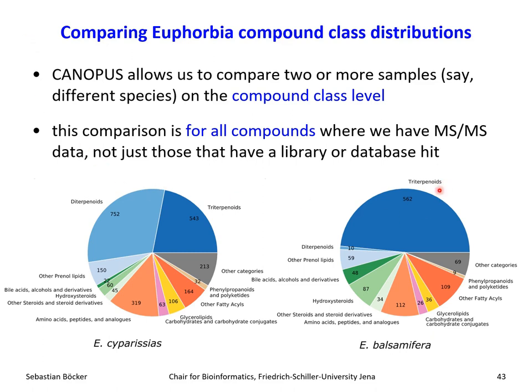And you might notice that triterpenoids looks bigger here than here, but that's not true. Like, it's almost exactly the same number of compounds that are annotated as triterpenoids. The big difference is the diterpenoids here. And you can see there are other differences on the compound class level. Now, keep in mind that those are not annotated compounds. I have no clue what those are. Some diterpenoids. As I said, don't care.